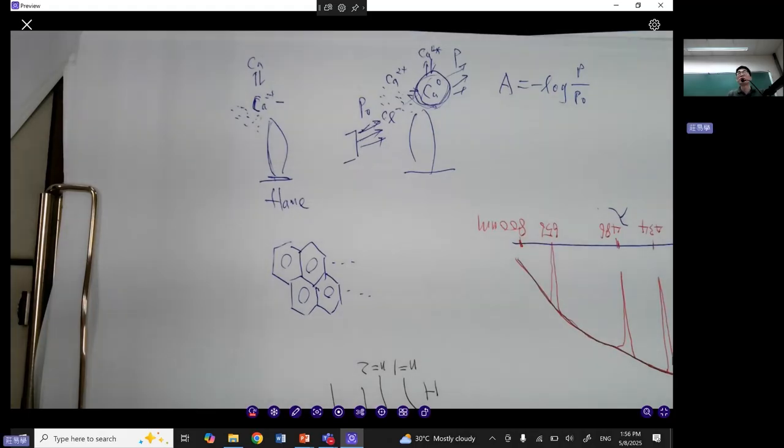And in the laboratory, how do you generate a flame? You burn something, right? So what is the thing you use to burn? A fuel. So for FAA, if you look next to the FAA machine, there is usually a bottle of fuel, acetylene, which is used to make the flame, because for combustion you need something that can burn. That fuel is acetylene.